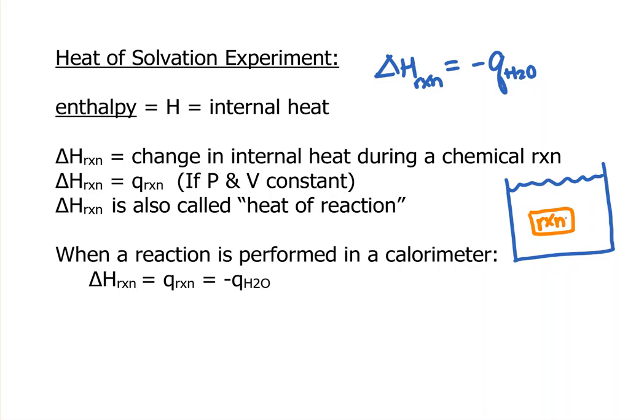Actually, most of your unknowns are endothermic, so we'll see that happen. The other thing is, when you do this experiment, the reaction isn't in a little box like this. You literally are just going to dump some salt in here and stir it and let it dissolve. So the reaction kind of takes place in the whole thing. And because you put the salt in and it's all mixed with the water, we will look at the change in temperature for the whole system. We'll call it the solution, which will include the water and the salt, and how much that changes.